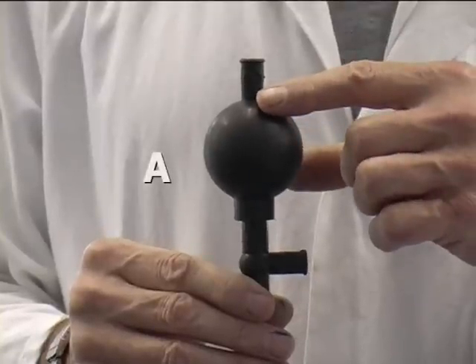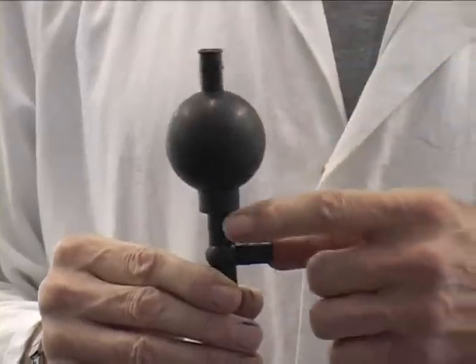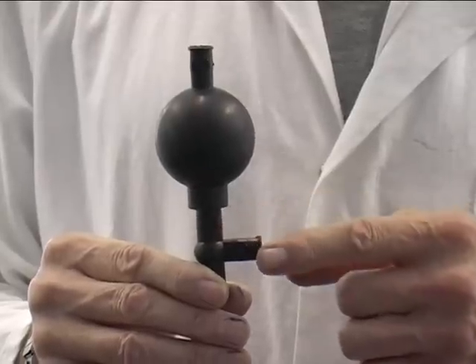Squeezing A with your thumb and forefinger allows the bulb to be evacuated. Squeezing S sucks liquid into the pipette. Now take care not to lift the bottom of the pipette out of the solution as this will result in the safety bulb being flooded. Finally, squeezing E empties the pipette.